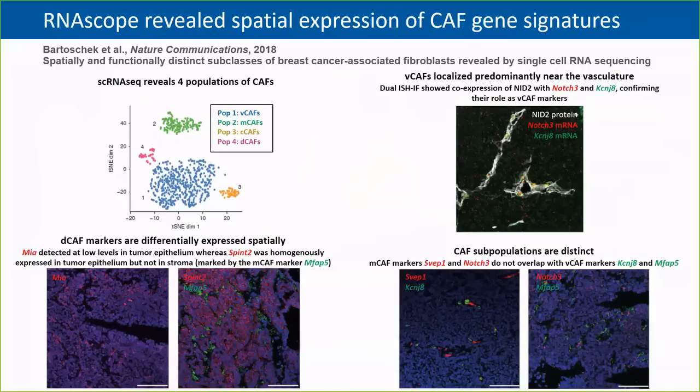Now, cancer-associated fibroblasts, also known as CAFs, are a major constituent of the tumor microenvironment in many cancers. However, morphology remains the most common way to distinguish CAFs, as molecular markers are neither all-encompassing nor specific. This suggests that CAFs may be a diverse group of cells made up of several subtypes. These authors utilized single-cell RNA sequencing to delineate the heterogeneity of 768 CAFs isolated from a genetically engineered mouse model of breast cancer. And they defined 4 transcriptionally diverse subpopulations of CAFs.